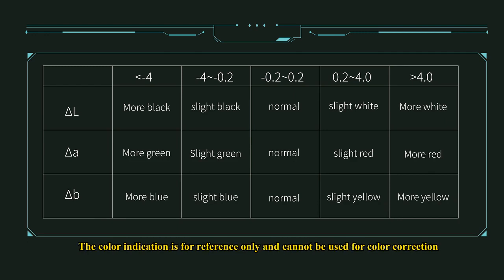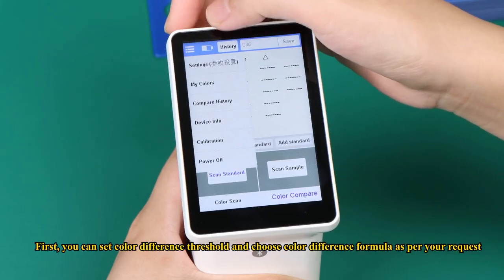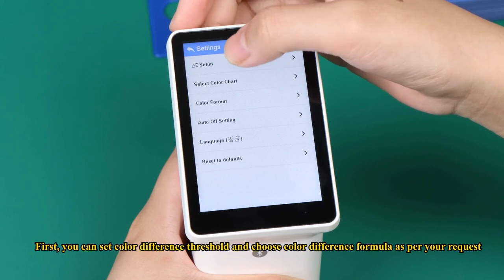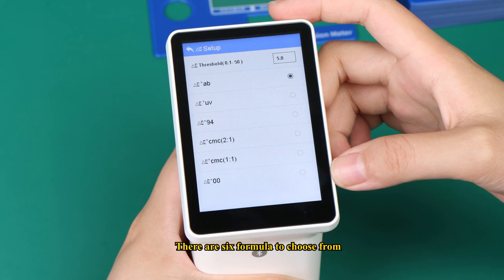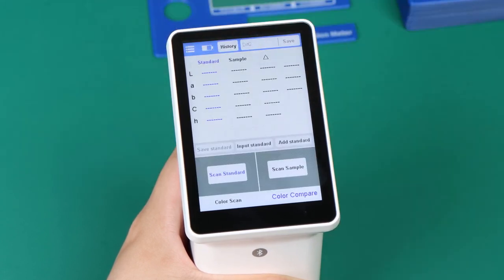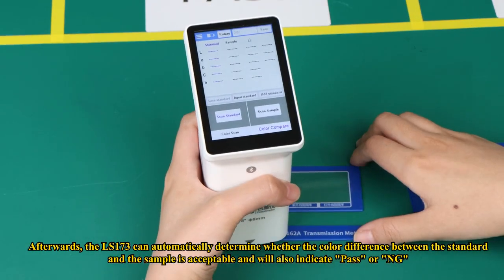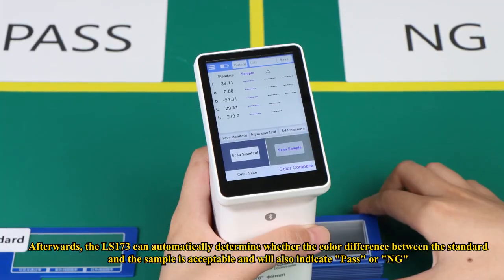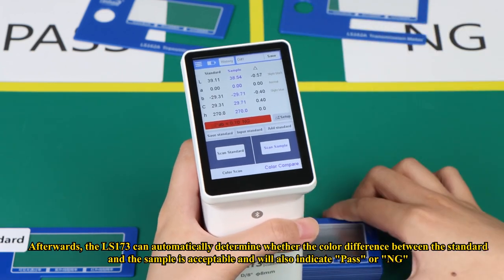The color indication is for reference only and cannot be used for color correction. To quickly check whether a sample is qualified, you can set a color difference threshold and choose a color difference formula as per your request — there are six formulas to choose from. The LS-173 can automatically determine whether the color difference between the standard and the sample is acceptable, and will indicate pass or NG.